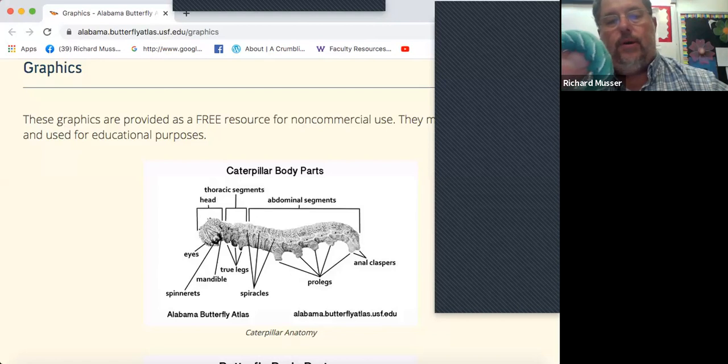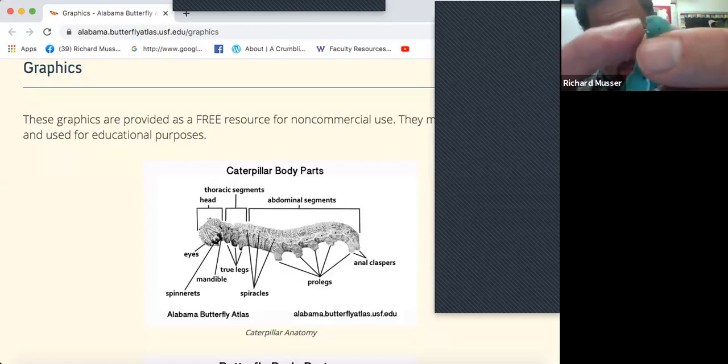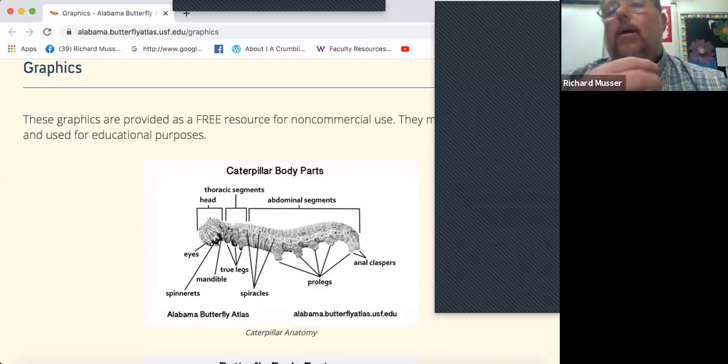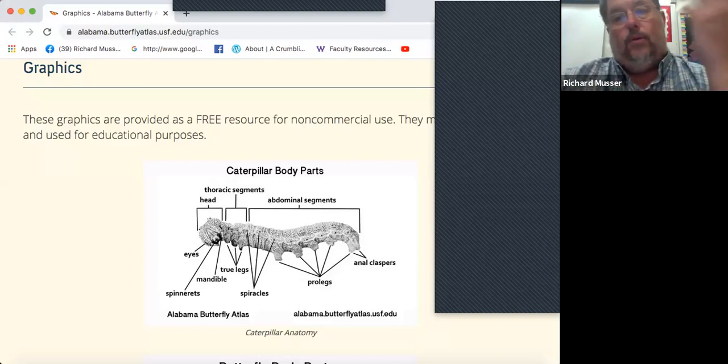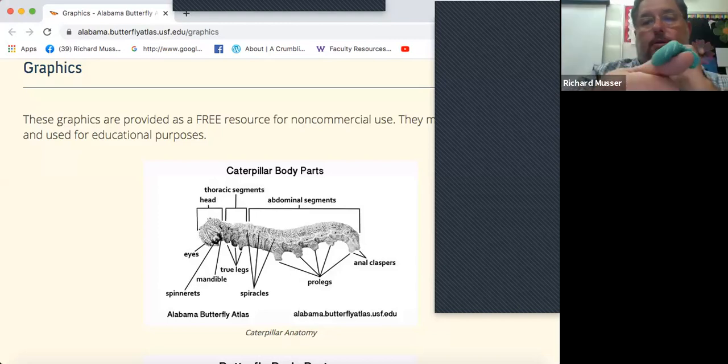This is the anal clasper down here. You see the spiracles and mandibles. The spinneret is kind of right underneath the mouth. It'll be almost like a little cone shape. Silk can come from that. There's silk moths or silkworms that can produce real silk that we wear, but these caterpillars can also lay it down as silk. When they're small they can use it for ballooning and helping to float or to cover themselves up.